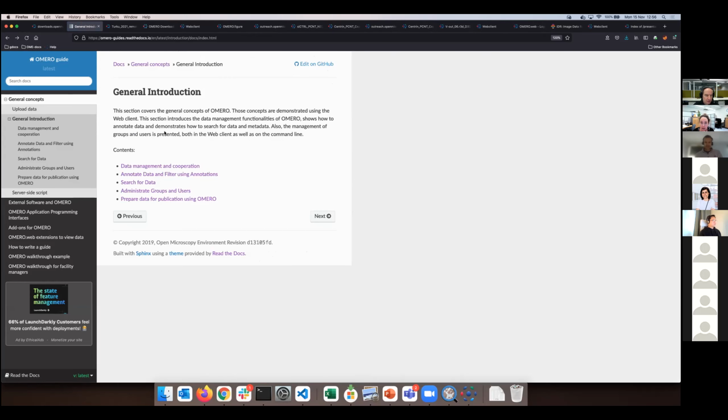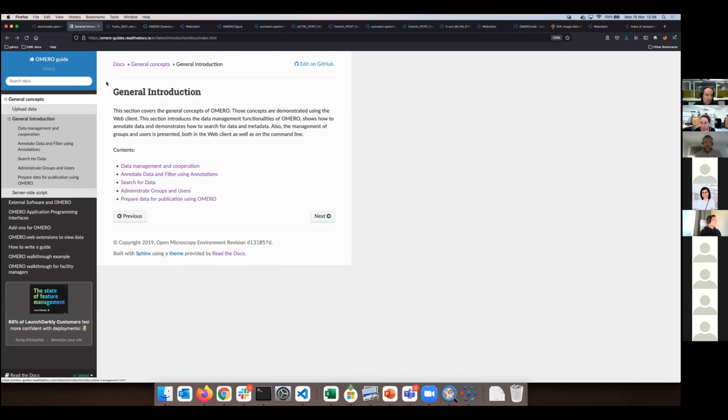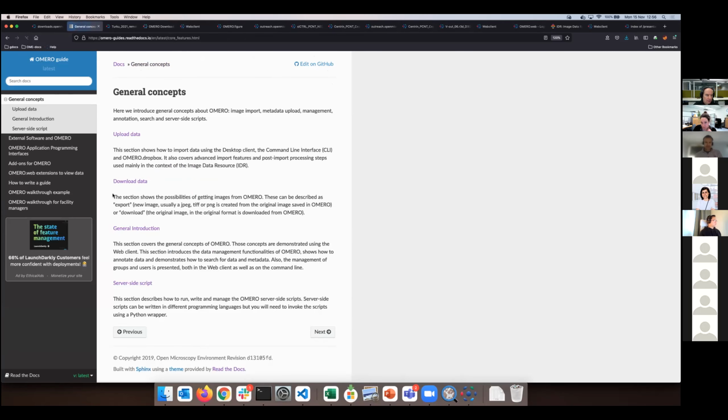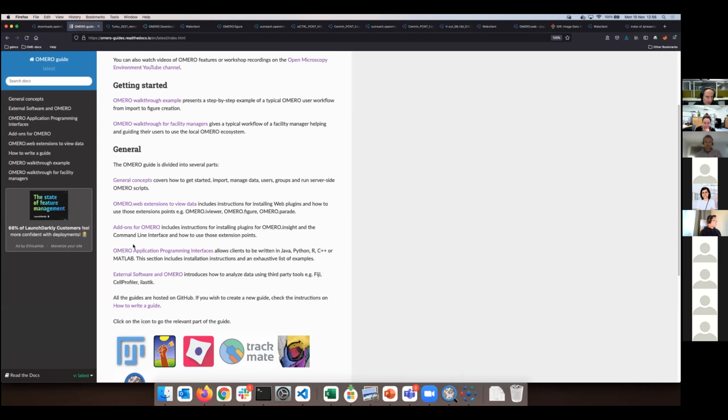This is nice. Okay, so this is on the docs page. For tomorrow, we have there the analysis part. I also went through the OMERO web extensions for data viewing, OMERO application, how to write a guide, programming interfaces.